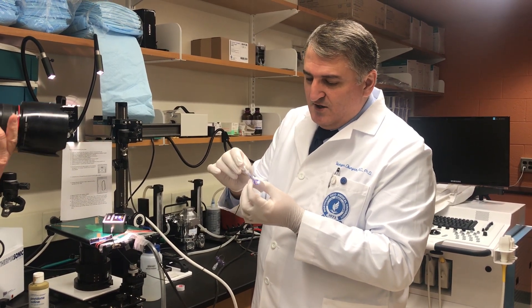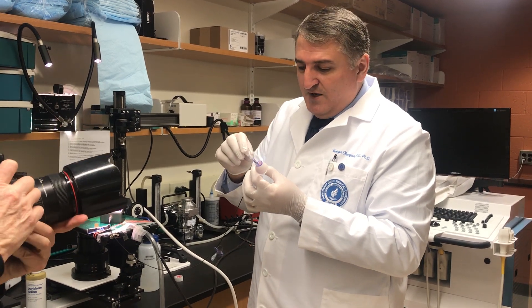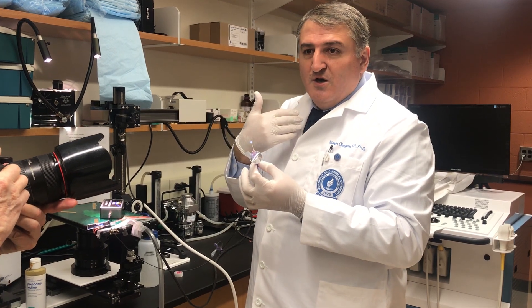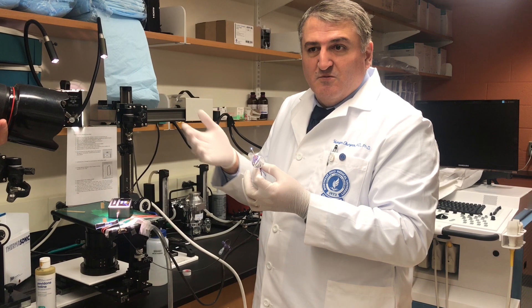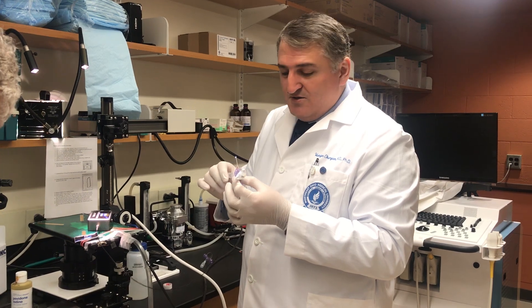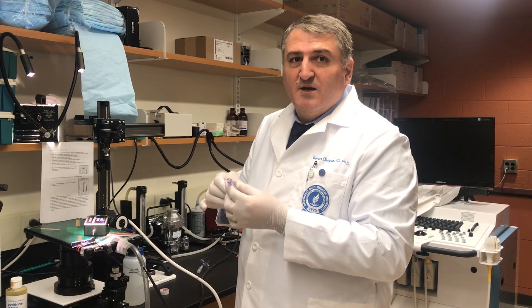Here we have a check bulb. When we intubate the animal, we inflate to see whether the position is correct or incorrect, because many scientists go incorrectly into the esophagus. If you leave it there for several seconds, the animal can die because you block the trachea — it's very tiny tissue. So we inflate, and if the position is wrong, you quickly remove and attempt again.